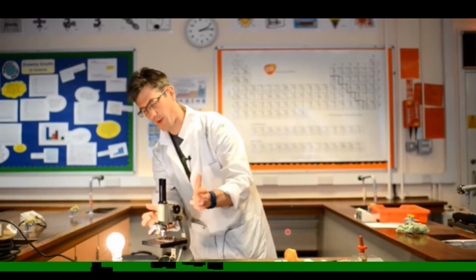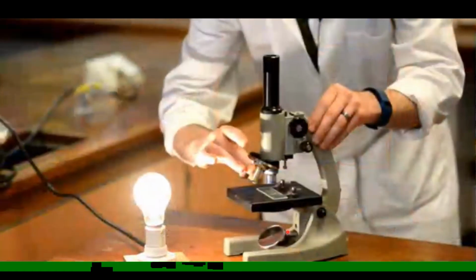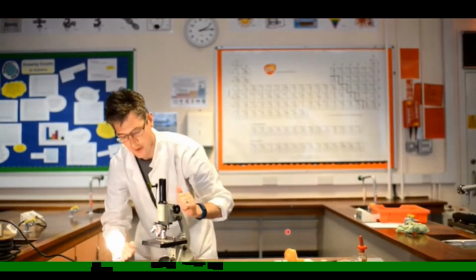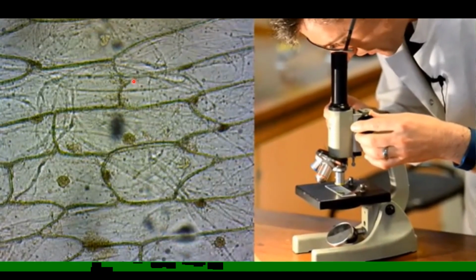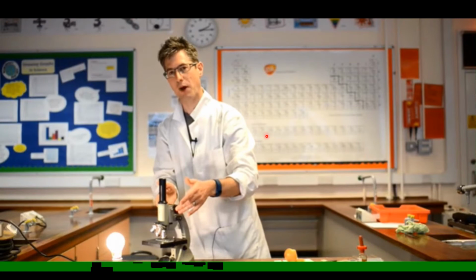And if you want to observe it more clearly, then you can use other two objective lenses, that is middle power and the high power. Objective lenses තුනක් තියෙනවා, low power, mid power and high power. Low power පාවිච්චි කරලා අපි නිදර්ශකය පැහැදිලිව නිරීක්ෂණය කරාට පස්සේ ඒක තවදුරටත් පැහැදිලිව නිරීක්ෂණය කරන්න middle power and high power lenses use කරන්න පුළුවන්. So now here it has used the middle power lens, and again you have to focus the image using this coarse adjustment knob. ආපහු මේ coarse adjustment knob එක චුට්ටක් adjust කරාම අපිට පැහැදිලි නිදර්ශකය බලා ගන්න පුළුවන්.